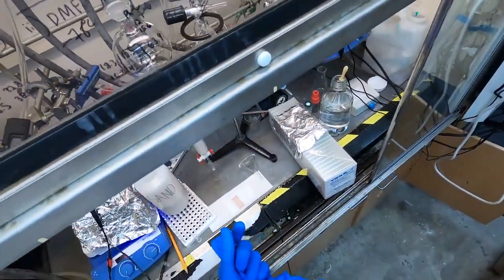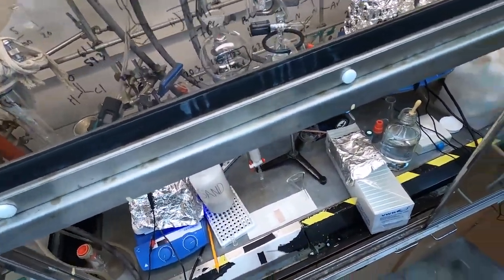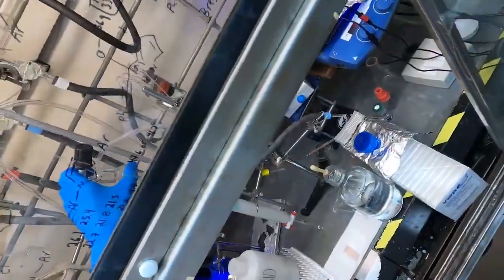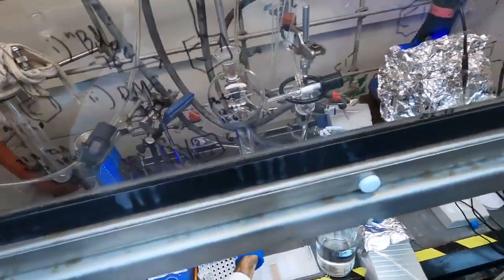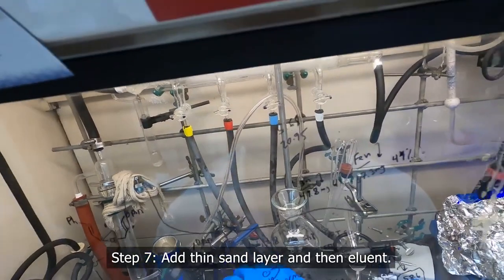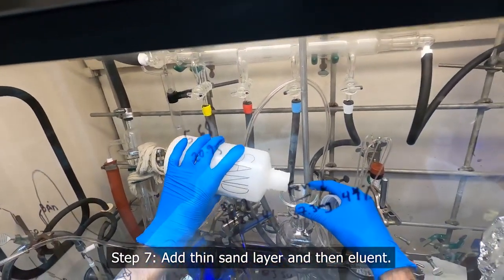Okay, so we have our Celite dry load all loaded in there, and then I'll put a little layer of sand on there, just mainly for protection when I pour the eluent in. It'll keep everything at a nice even layer.